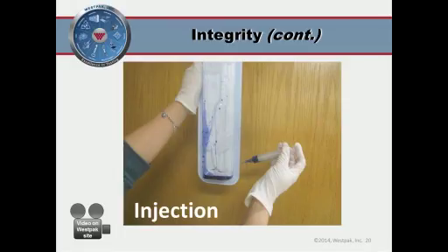And because porous packages have these very small channels on them, that's how it becomes porous, the procedure suffers from what I call a time relevance, in that the dye penetrant solution will wick into the porous materials, such as Tyvek, readily over time. And it also makes a mess, or potentially could make a mess. So it's important to read the test quickly. It is very time sensitive. Katie?